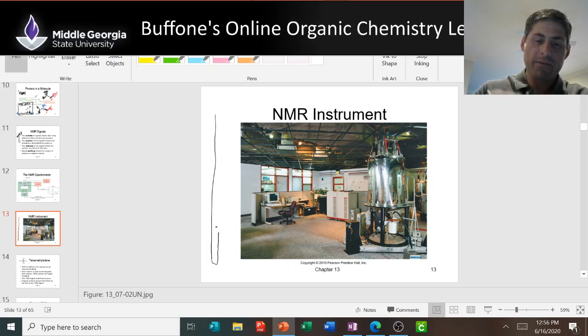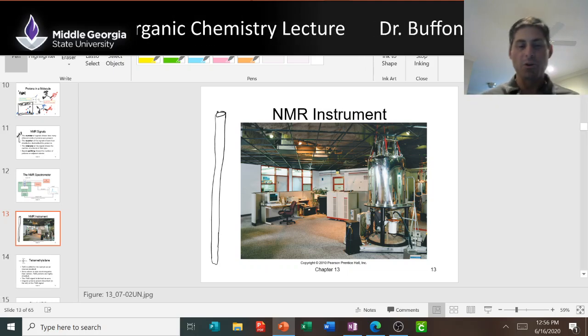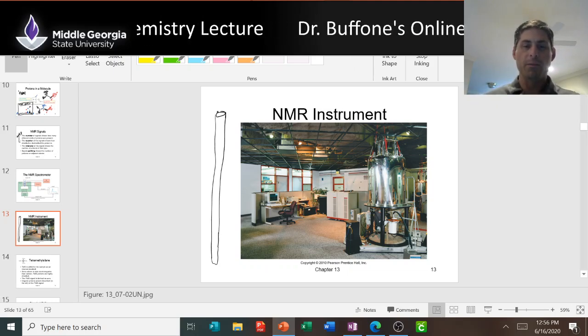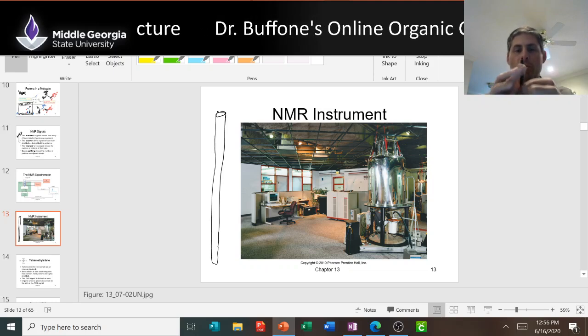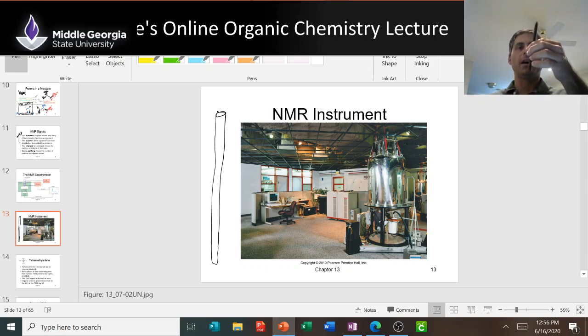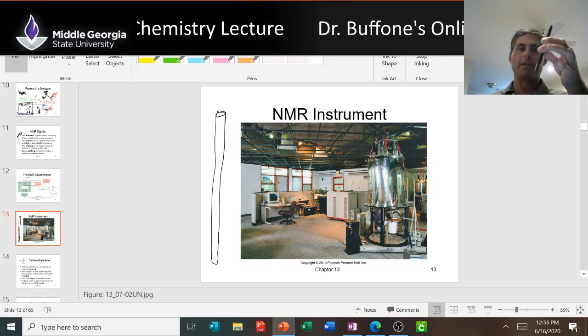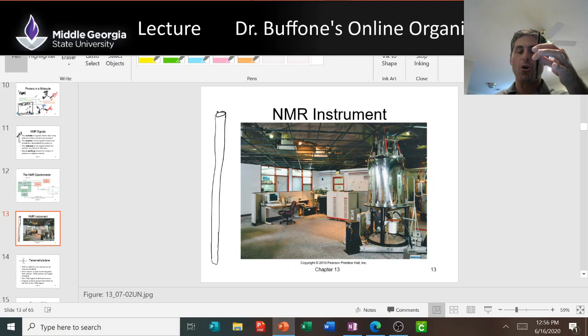They're about that wide. They're a little bit longer than this, but you can hold it in your hand. Almost, this pen I have is kind of thick, but it's almost the length of a pen, and it's almost the width of a pen. It's got a closed end and an open end.